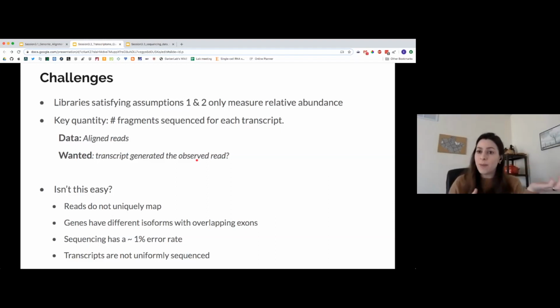So you can never go back, just like you can't be sure of which sequence in the genome originated that read, you can never be sure of exactly the amount of RNA you had in your original sample. What you can be sure of, more or less, given these problems and taking them into consideration in your quantification, is the measures of other transcripts relative to the one you captured. So that's the information we have to deal with.